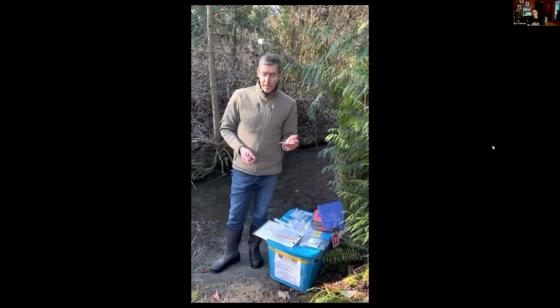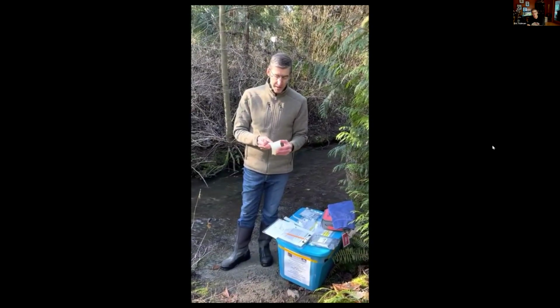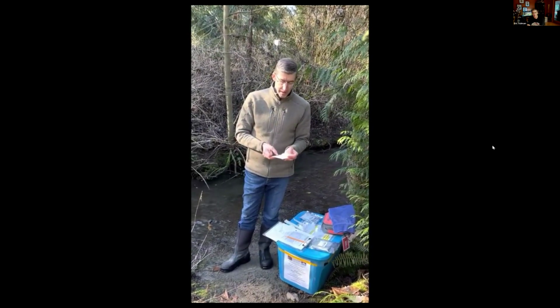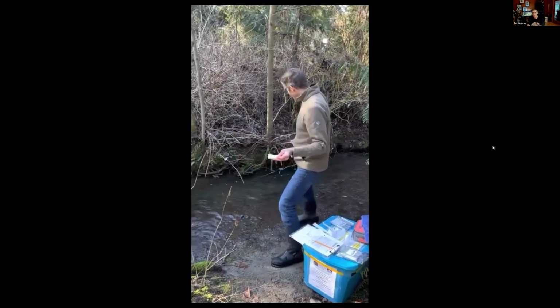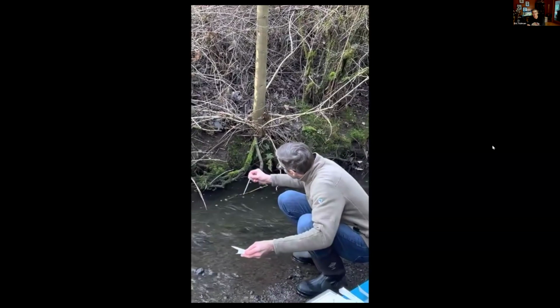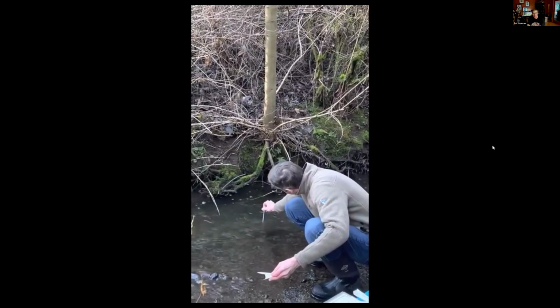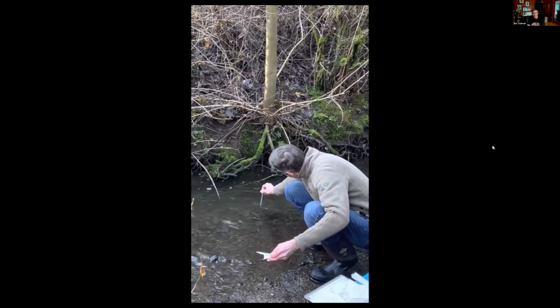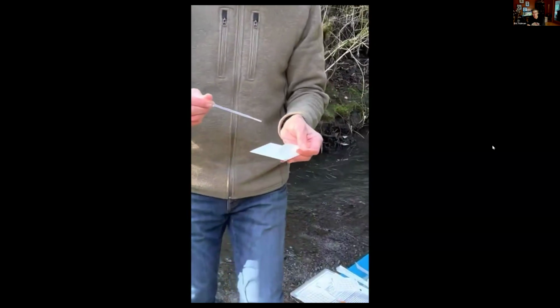So now in this case, I could have a partner holding this card, or I could be holding it myself. In this case, I'm going to get it ready to go so that when I collect my sample, I'm ready to put it right onto the R card. So I'm not going to get into the creek. I'm going to just draw my sample, making sure I'm not on the bottom of the creek. Okay, so I've collected my 1 ml sample.